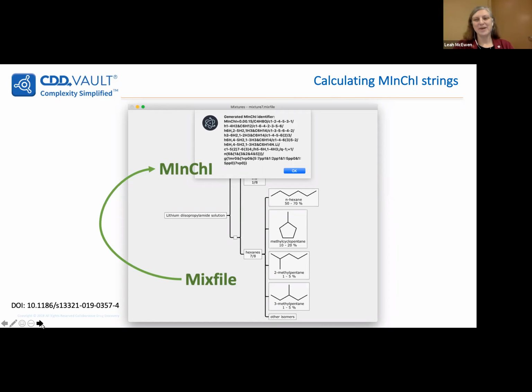I would say that the software development community is another high win for incorporating this type of work, and getting this functionality into the pipeline all the way through. Again, being able to pull that vendor data and incorporate it into your LIMS and ELN systems all the way down the pipeline, and that will open up this functionality for scientists as well as informaticians. So I think that'd be a great benefit.